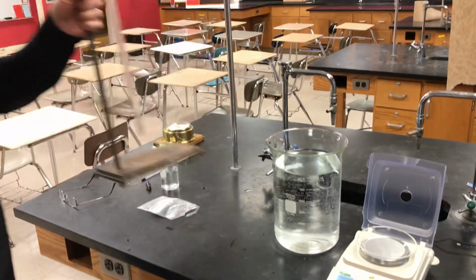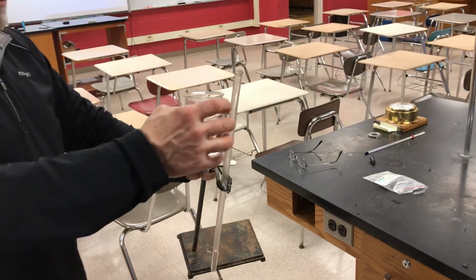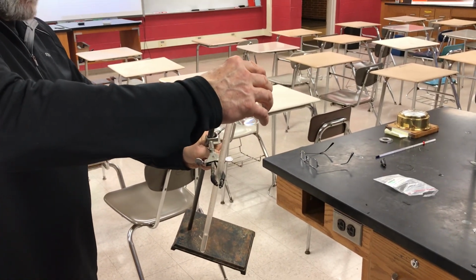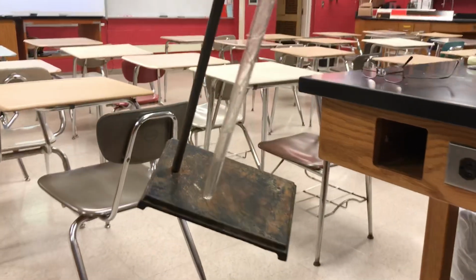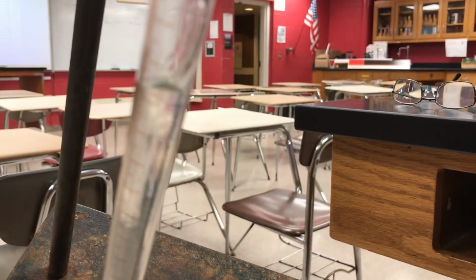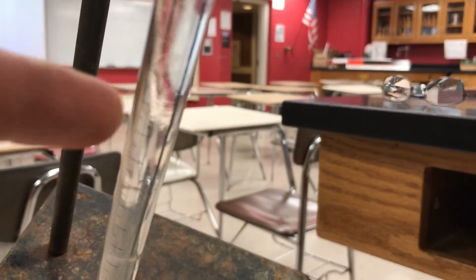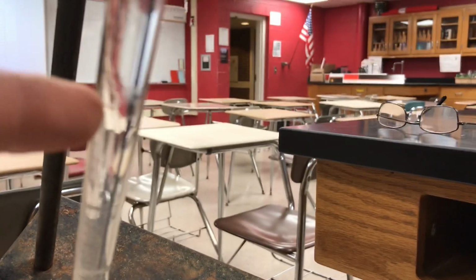Now we're going to add the water to the eudiometer. So I'm going to tip it and try to just gradually pour the water down the side of the eudiometer so we can prevent the water and the HCl from mixing very much. See, they mix a little bit in here. Kind of see a shimmering effect.